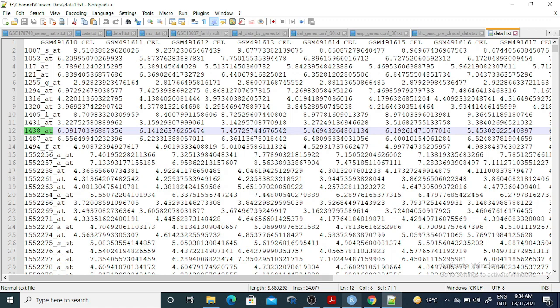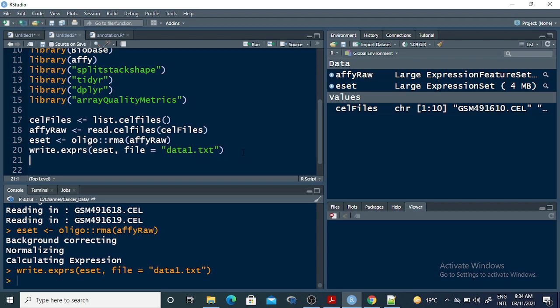Since the gene information is not included, we need to annotate these probe IDs against the genes — that is the next step. A lot of students asked about annotation, so this part is for them. If you want to check the quality of the data first, you can use the arrayQualityMetrics command to find the quality results.